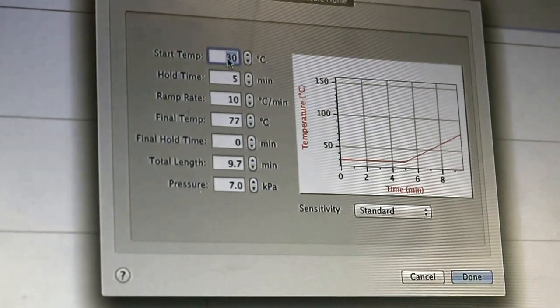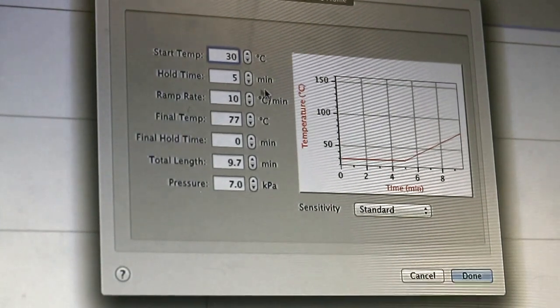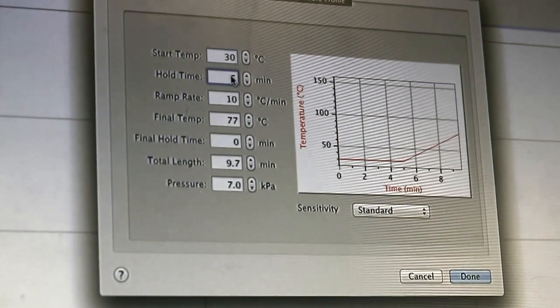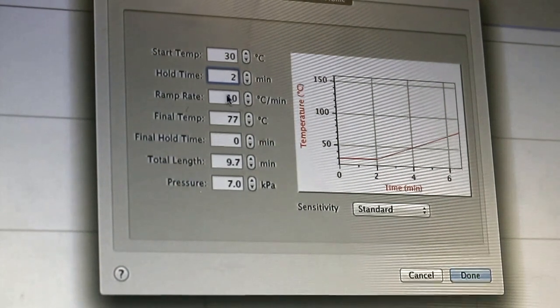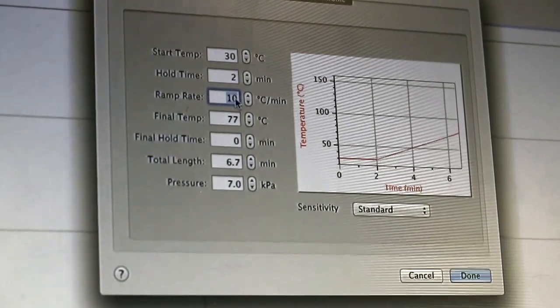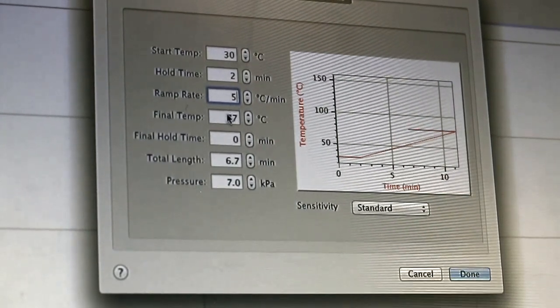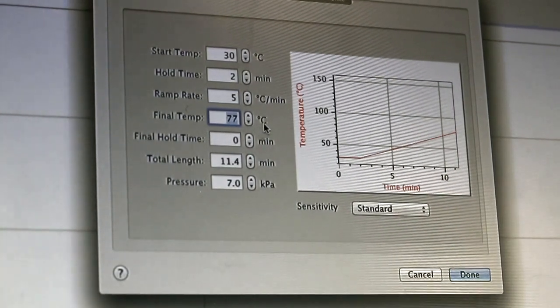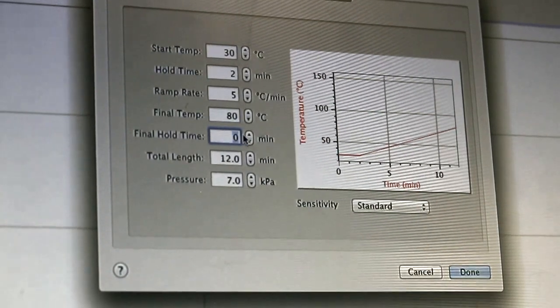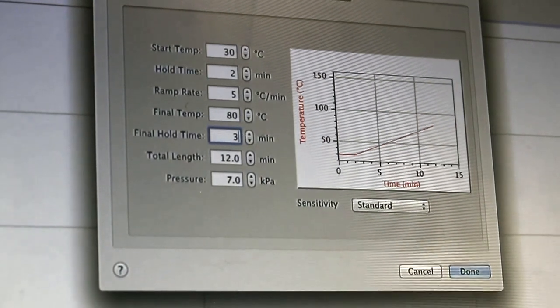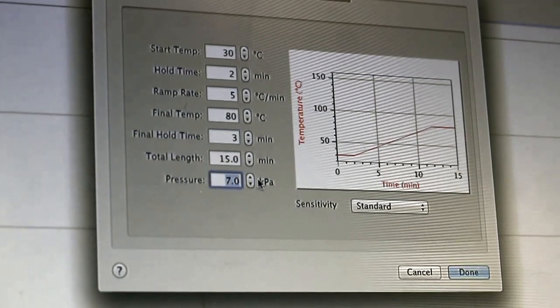When prompted, enter the following parameters: Start 30°C, Hold 2 minutes, Ramp 5°C per minute, Final 80°C, Hold time 3 minutes, Pressure 8 kilopascals.